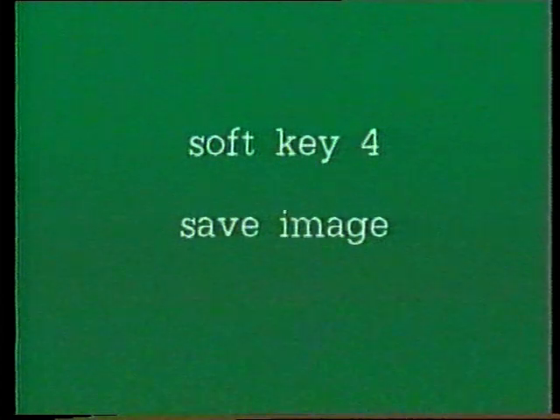To make sure that we are in focus, let's first increase our magnification from 5000x, and in this case I will go to 30,000x. At that magnification, I will then obtain the sharpest focus. Let's now return to a magnification of 5000x. And if we need to register, we can use the image shift, which is function key number 3, and using the arrows in order to align the sample with our registration mark. Once we have that, we can then go to the Save Image soft key, which is soft key number 4.